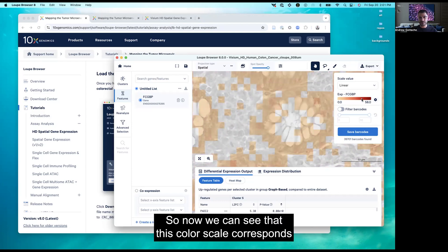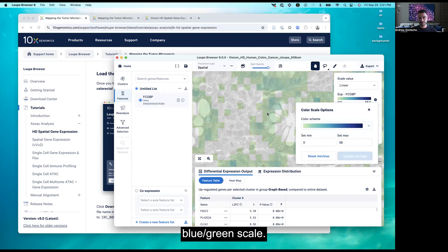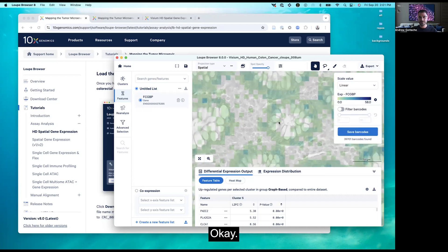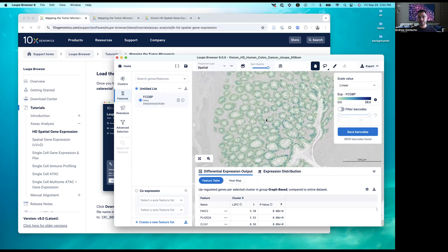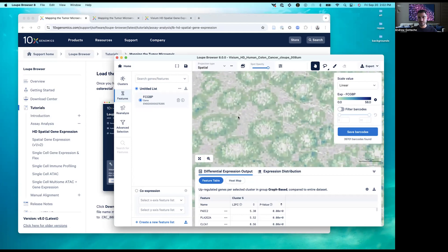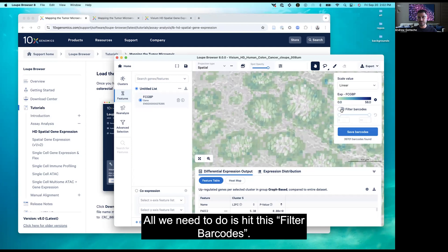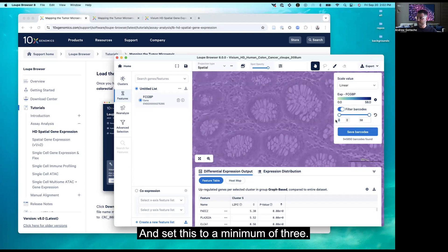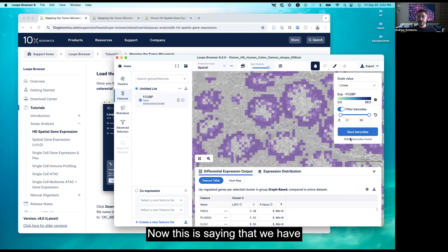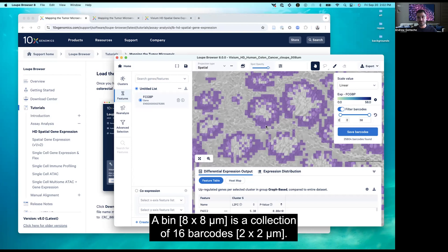Now we can see the color scale corresponds just to UMIs. Let's choose a blue-green scale. Zoom out a little bit and you can really see where this gene is being expressed — it's expressed where we expect it to be. There are a few scattered UMIs elsewhere, but we can easily filter those out. Hit Filter Barcodes and set a minimum of two. This shows we have 25,804 barcodes with at least two UMIs per bin. A bin is a collection of 16 barcodes.